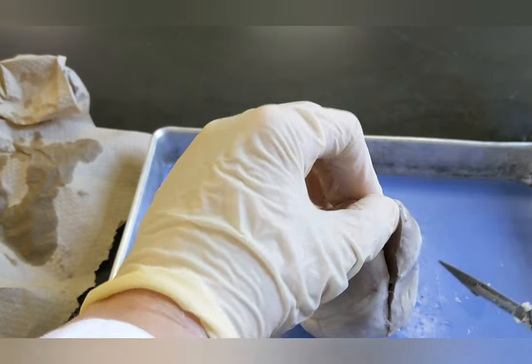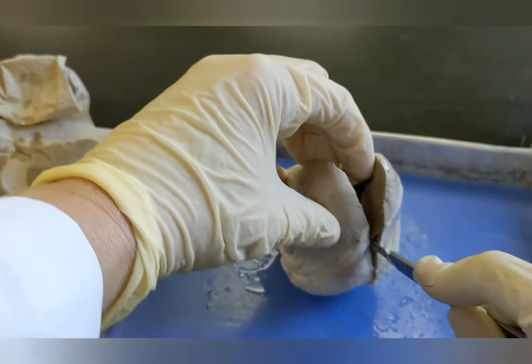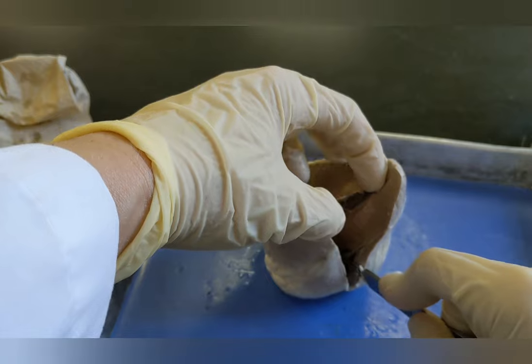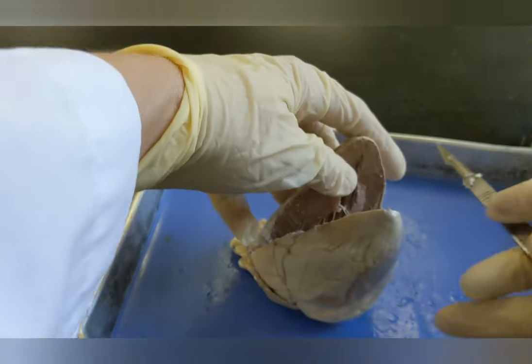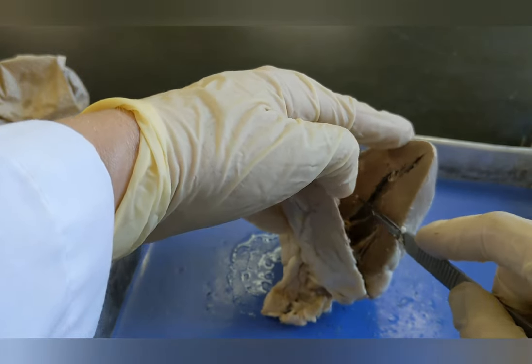Some people like to leave the heart attached at the top, and I'm going to do that this time. You can also cut all the way through if you prefer. And I can already see all the strings that are part of the valves here.